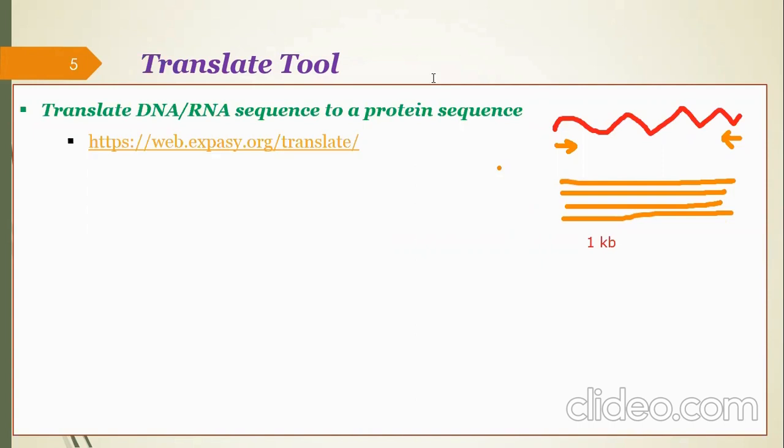So what we do is run this on an agarose gel, and we run a ladder in one of the wells.